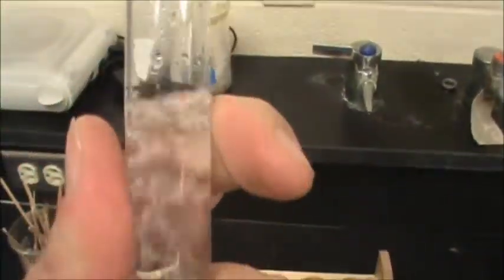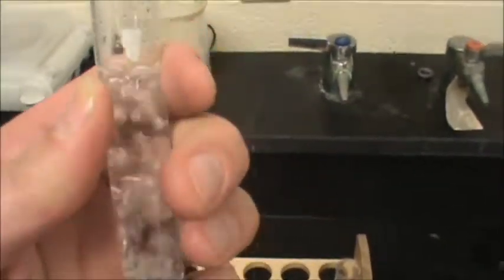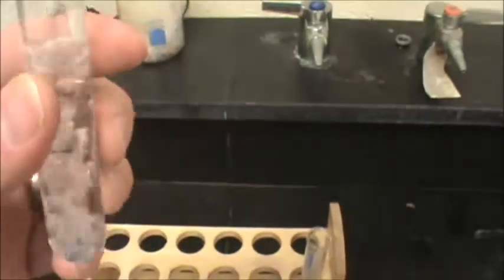And if you want to, you can actually feel the test tube. You can't feel it, but I can, and it feels warm to the touch. So it's giving off energy. Exothermic reaction. Alright. Anyways, the next part of the procedure says to take a test tube and invert it.